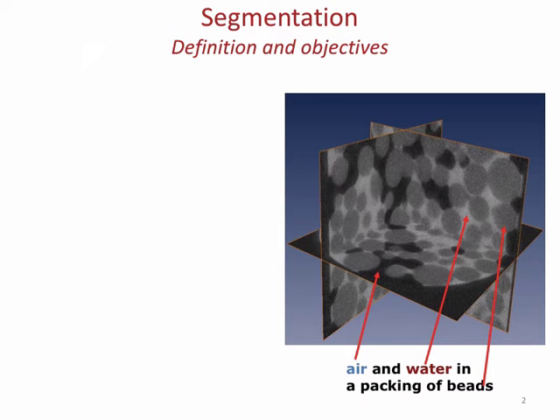Even if I fix this one up, where I basically just remove this inner portion and call all of this oil, it seems that I have a layer of wetting and non-wetting fluid along the solid surface, which is physically wrong here. So this appears as a layer of non-wetting fluid simply because I have a dark line.